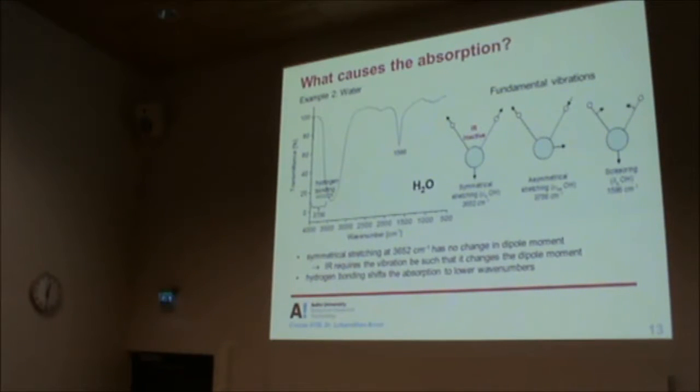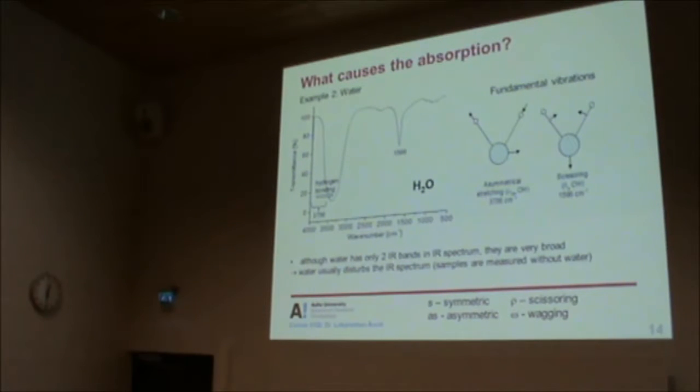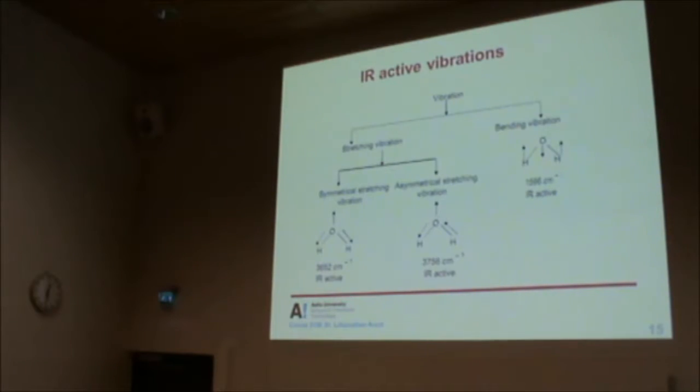In Raman, you don't have this problem. In Raman, you can have a wet sample. You can actually do in situ measurements. That's what Thomas was telling the other day, that you can follow a reaction in water. But in infrared, water must be removed. Samples should be measured without water.